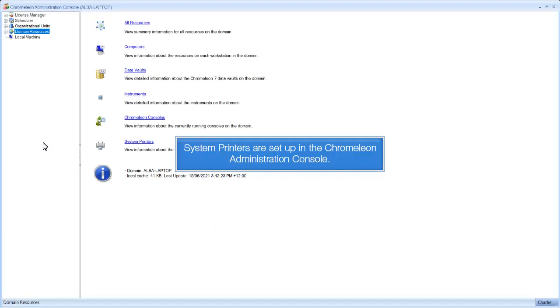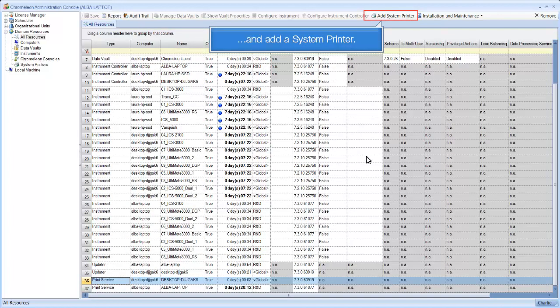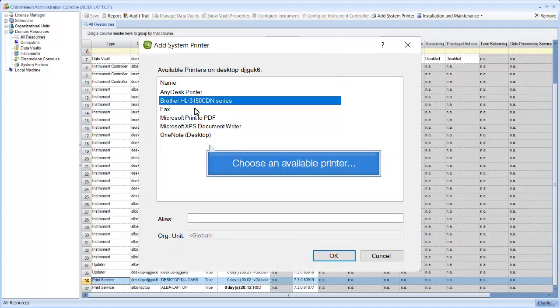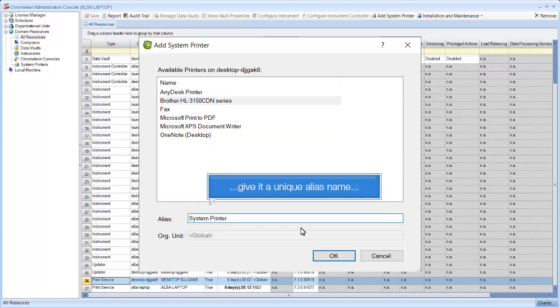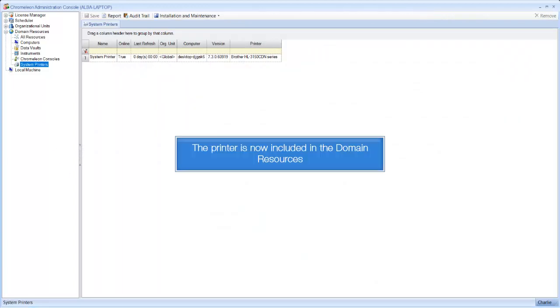System printers are set up in the Chromelion Administration console. Choose the print service of the server or PC you want to use, and add a system printer. Choose an available printer and give it a unique alias name. The printer is now included in the domain resources.